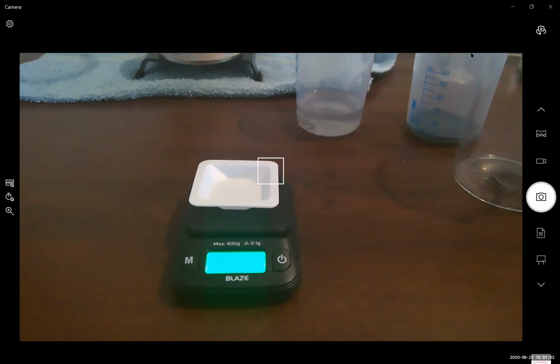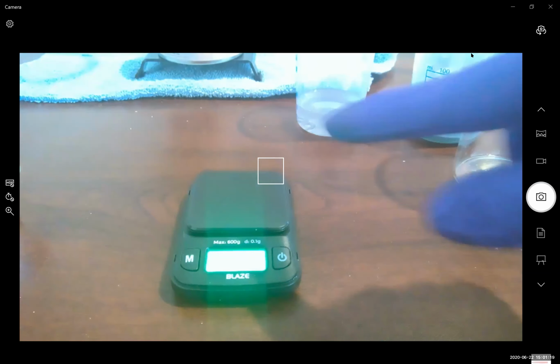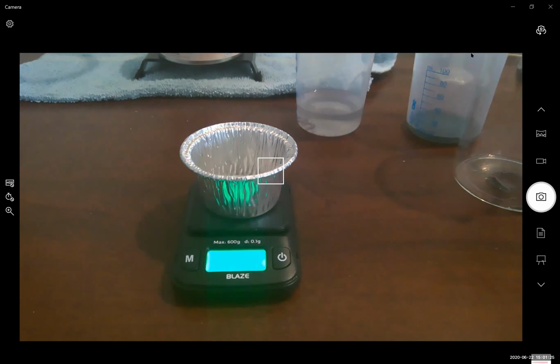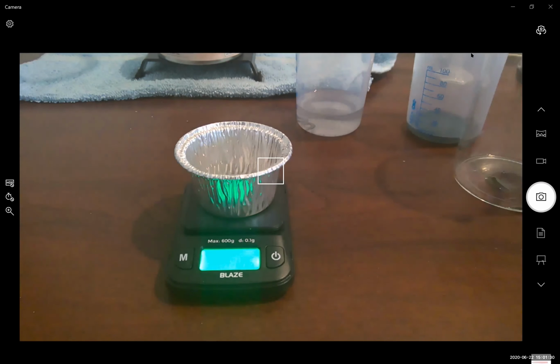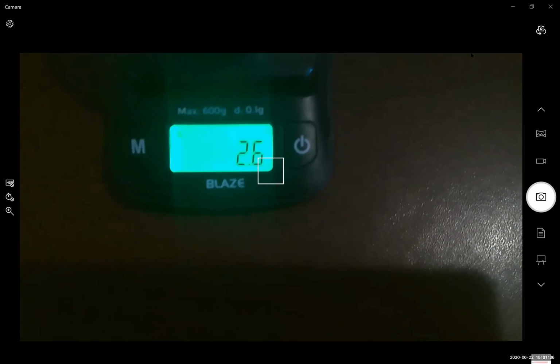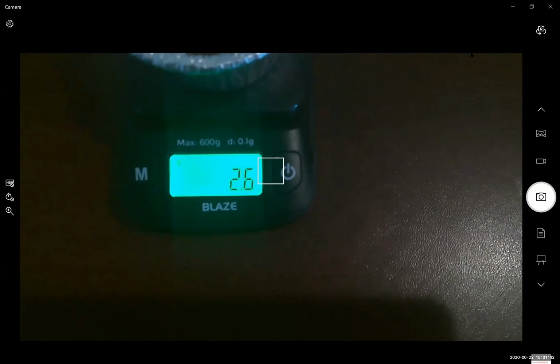Now, what we're going to do is use our spatula to transfer the contents of our aluminum container to the weigh boat. But before we completely do that, as an external check, we're going to record the mass of our copper plus our aluminum weigh boat. So let's record the mass of our copper plus our aluminum weigh boat before we transfer it. So here's the mass of the copper and the aluminum cup before transferring.